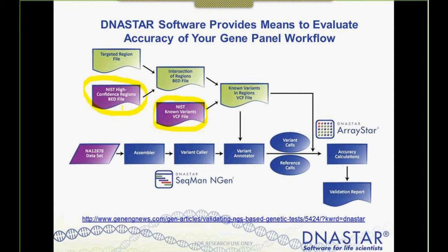And this is a little piece that we can help customers with. But it is using these purple reference materials that I have in the flow chart essentially as the answer, and we can compare them then with your own bed files or VCF files to come up with an accuracy estimation. So again, we can help with this part, but it's a multi-step piece.